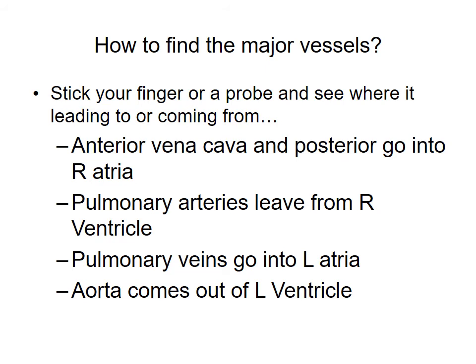When dissecting your heart, one of the easiest ways to identify which major vessel you're looking at is to take your finger or probe into the opening to see where it's coming from. The anterior vena cava and posterior vena cava both go into the right atrium. The pulmonary arteries leave from the right ventricle. The pulmonary veins enter through the left atrium, and the aorta comes out of the left ventricle.